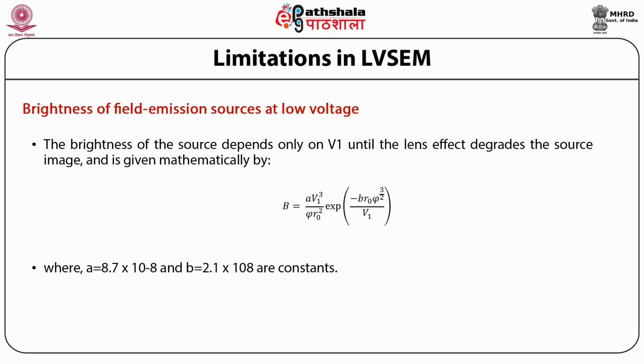Second, the current generated by the source is subject to temporal instability that produces streaky images.